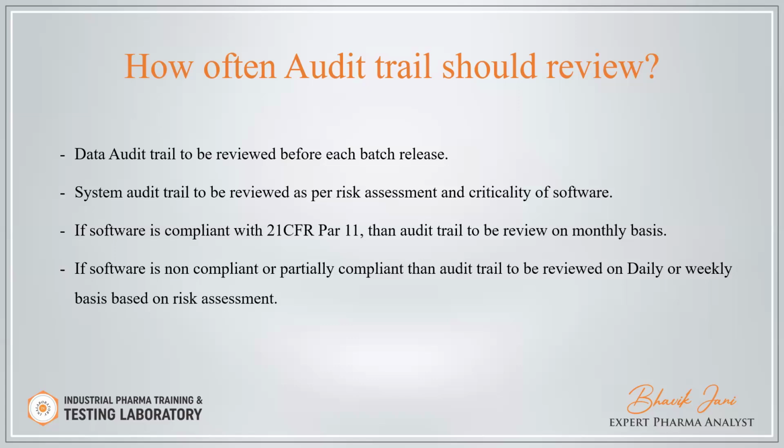If the software is compliant with 21 CFR, then the audit trail is to be reviewed on a monthly basis. If the software is non-compliant or partially compliant, then the audit trail is to be reviewed on a daily or weekly basis based on the risk assessment.